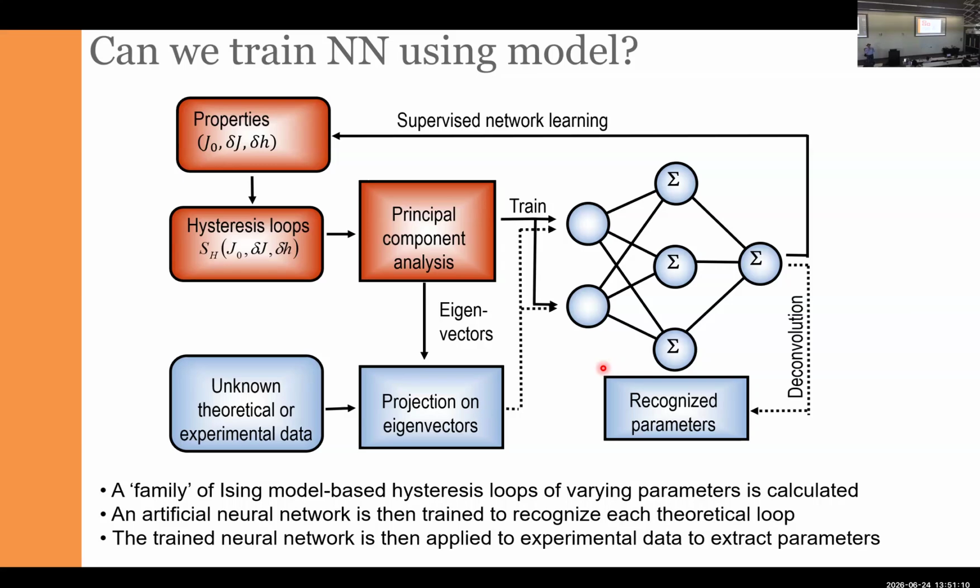If something like this happens, you always have to focus on what it is that you postulate. For example, you have reasons to believe that the model is correct, and therefore all the deviation of data from the model is something about the non-ideality of your imaging system or what not. Or you can choose the approach that you absolutely believe the data, and then the comparison between the model prediction and the data basically tells you how well the model captures the data. So you see the difference, right?